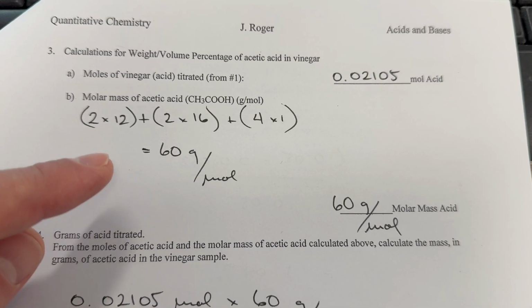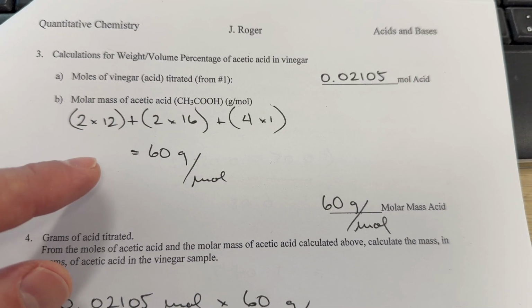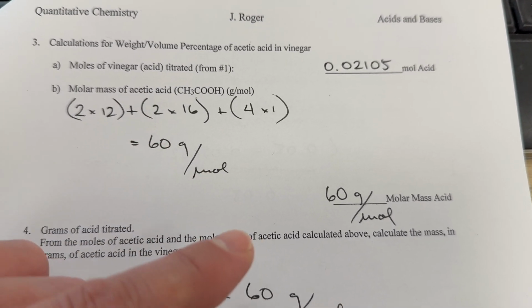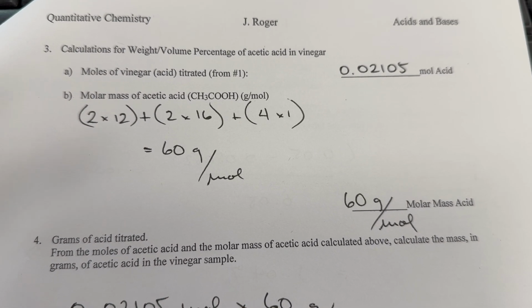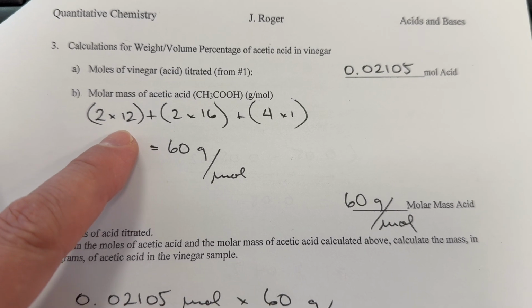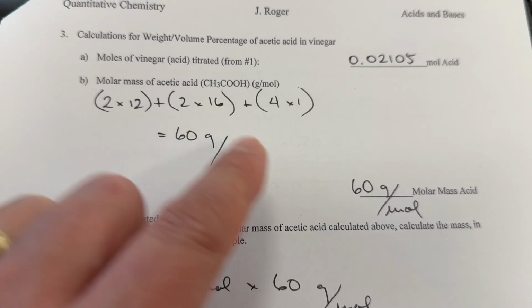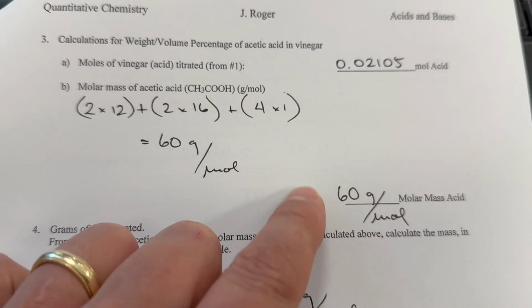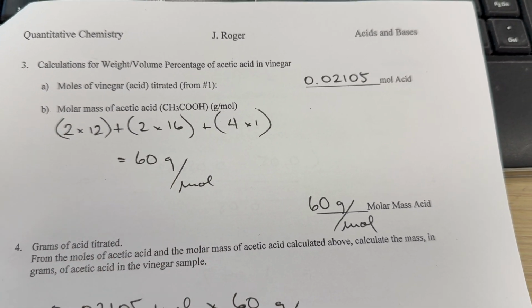We know that we can calculate the molar mass of acetic acid, CH3COOH, carboxylic acid. So we have 2 carbons at 12 grams per mole, 2 oxygens at 16 grams per mole, and 4 hydrogens at 1 gram per mole. So acetic acid has a molar mass of 60 grams per mole.